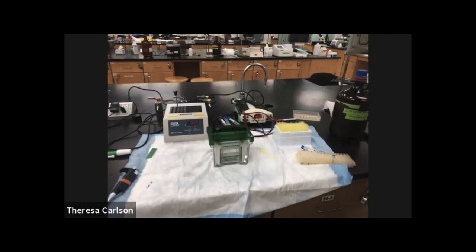And they move into the resolving layer of the acrylamide, and then they will begin to separate out by size. You will not see the actual protein bands because they have not yet been stained with Coomassie blue, but you will see the size markers because the size markers have already been stained to allow you to witness them separating on the gel.